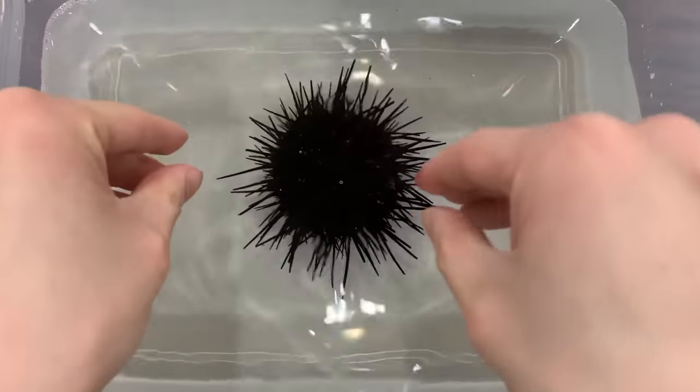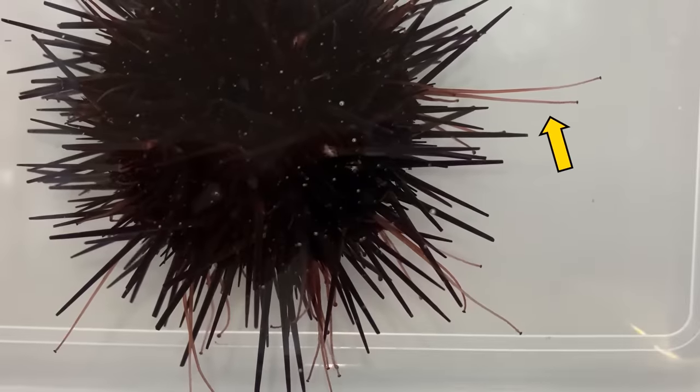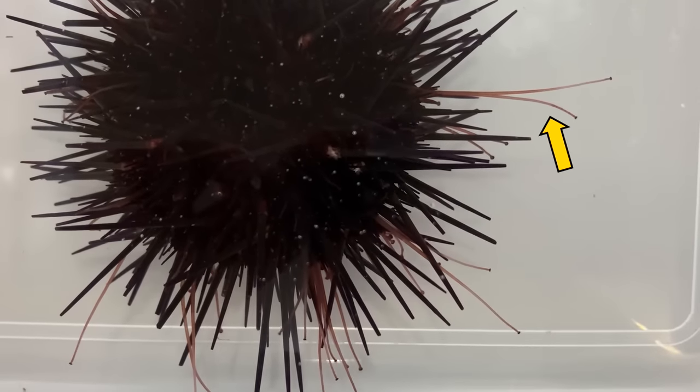If you put a sea urchin in water, tentacles come out. What is this?